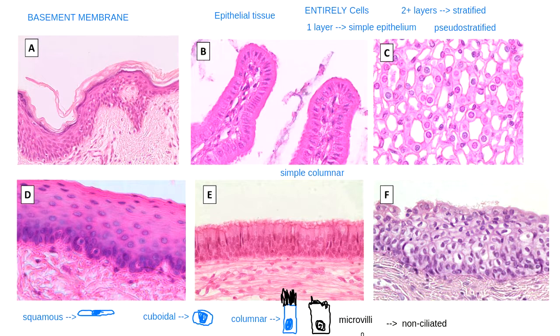Non-ciliated, meaning you have microvilli or you don't have cilia, more accurately. When I look at my picture of my tissue up here, when I look at the top of these cells, does it look like I have eyelashes or peach fuzz on the top of these guys? Can we tell? Yeah, we got the peach fuzz going on these guys, because compare that down here to these guys right here. You can see the individual eyelashes on the top of these cells here. So this is an example of the type of epithelium that has peach fuzz, which means it has microvilli.